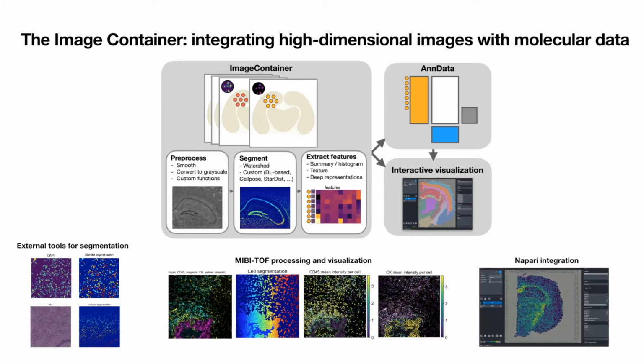These are some examples, but you will also see at least some examples of the segmentation and of the visualization or plotting functions in the Spatial Transcriptomics image analysis lab that we are also going to look at this afternoon. So this will deal with essentially all of these steps: the preprocessing, the segmentation, and extracting features from images.